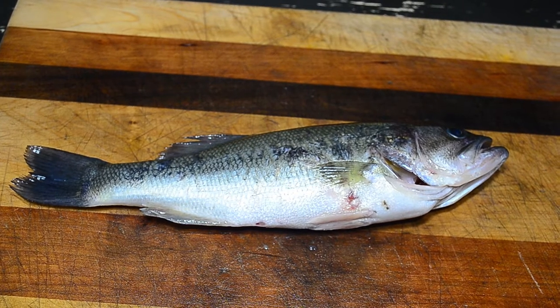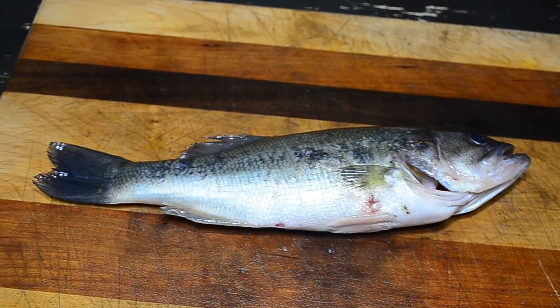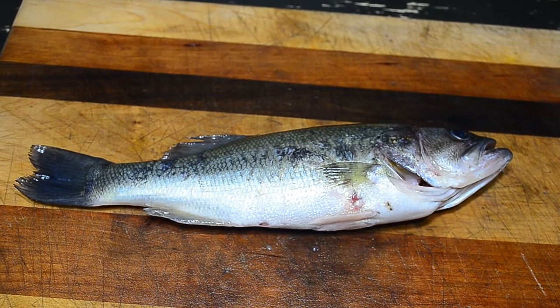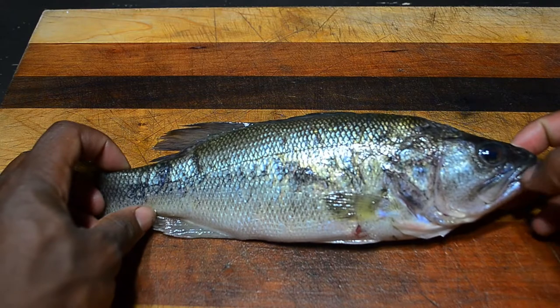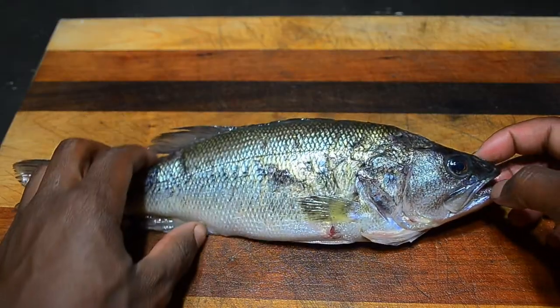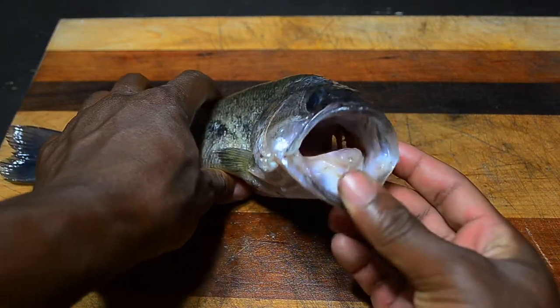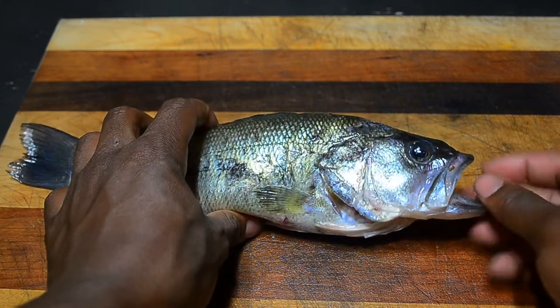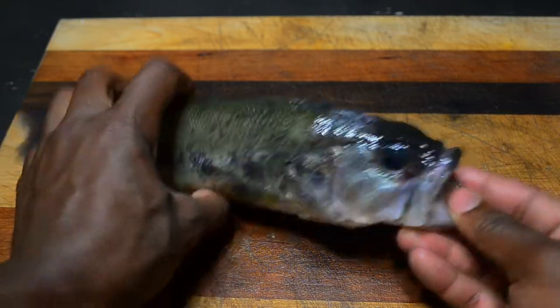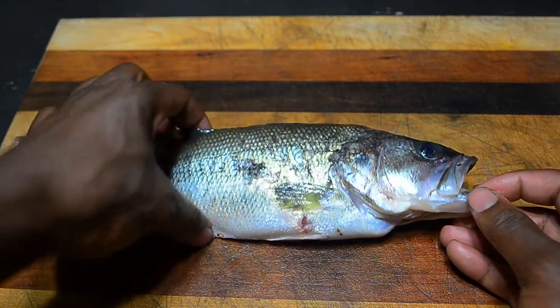We are finally back with another dissection video and today it's going to be the largemouth bass. Starting with the external features: large eyes, large mouth. When it opens, their feeding method is a ram feeding method — they open their mouth and swim towards their prey in a burst of speed, basically using suction and ramming into the prey.